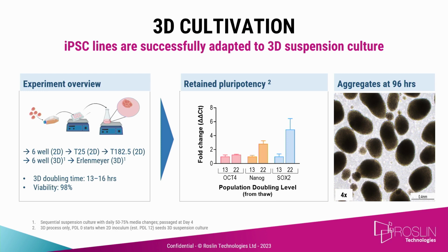going up and forward. So these cells grow as aggregates. We don't need microcarriers. They aggregate and form these spherical spheres of cells that are kind of difficult to control the size and the shape. But if you manipulate those process conditions, you can see how you can adjust the mechanical forces of the reactor, the aeration, the oxygenation, to manipulate those conditions to change that profile a little bit.